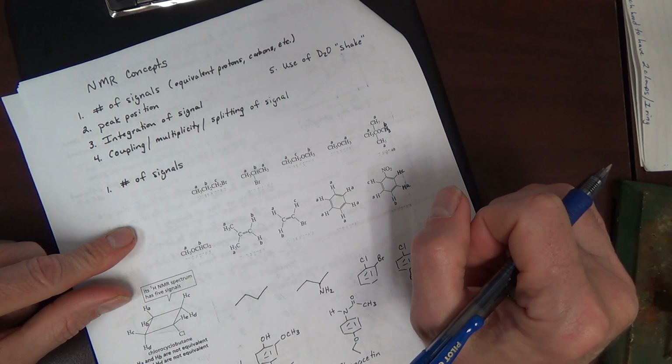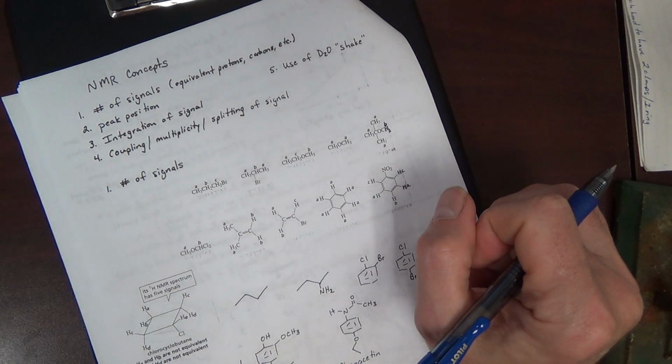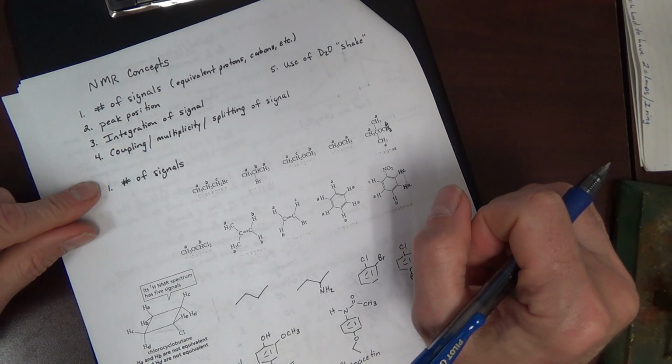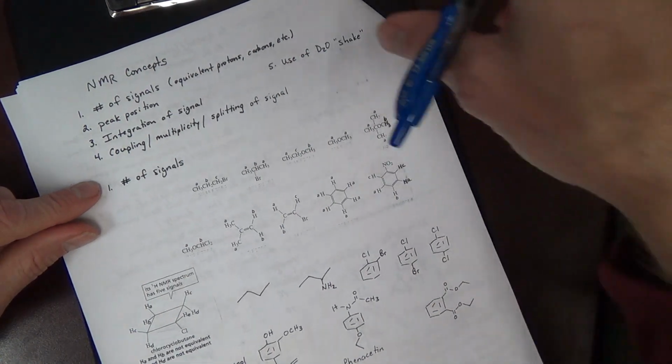Ultimately, we need to be able to identify when types of H's are the same or when they're different. Now this should be pretty straightforward, because when they're different, they're different. There will be some cases where we think they're the same, but it turns out they're different as well. Ultimately, let's just do some examples and see how we do.